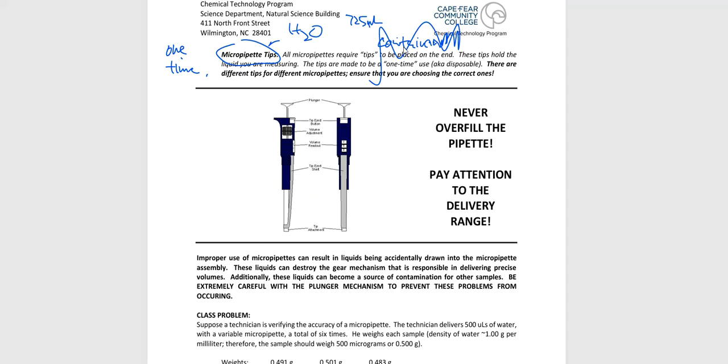All right, so what you're seeing here in the image is a micropipetter. On the micropipetter, you will see a dial, and there's the dial. I see it. There's a set of numbers. I will give you a warning. We do have student versions of micropipetters, and you will see 3 digits on the scale and a couple of tick marks down here at the very bottom.